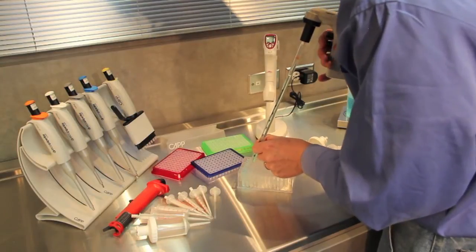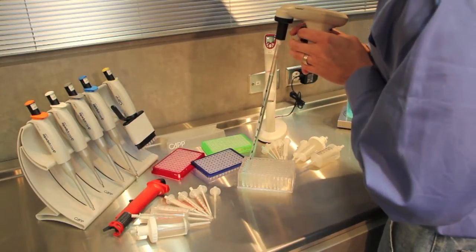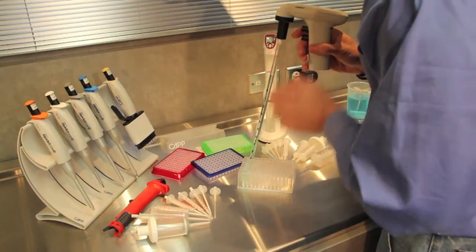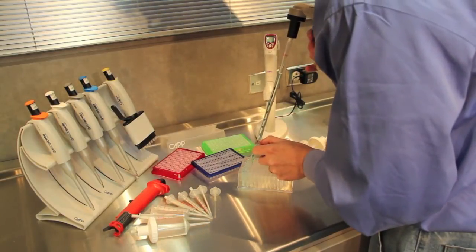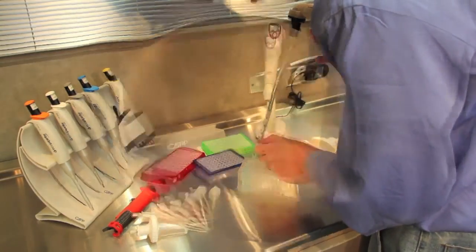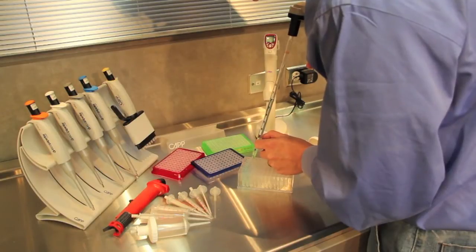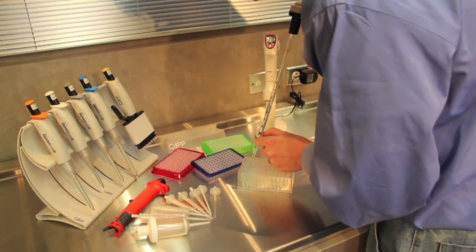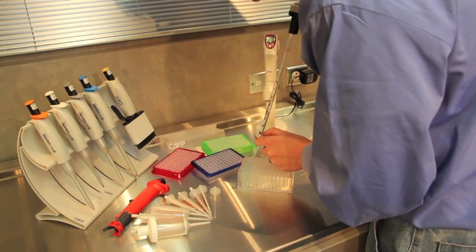You can actually set it up so it pushes the liquid out, or there's a button on the back where you can go to a gravity dispense which gives you a little more control. This would be a good option if you just had to get some media in each one of these wells but you weren't concerned with having exactly 1ml in each one of them.